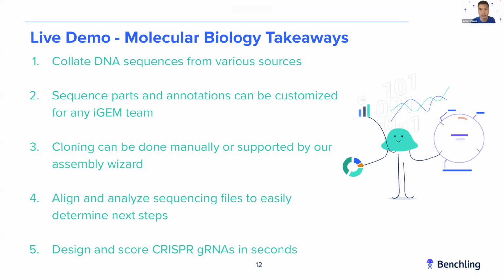I want to introduce a small caveat. Hopefully I've addressed this in the chat, but if you do plan to do any kind of COVID-19 work for your iGEM project, please make sure to check the iGEM guidelines on the iGEM website and take a look at the safety forms that you need to fill out if you plan to pursue those types of research projects. For the purposes of this demonstration, Benchling just wants to show you how you can integrate those particular workflows, but it's still up to your iGEM team if that's something you choose to undertake.